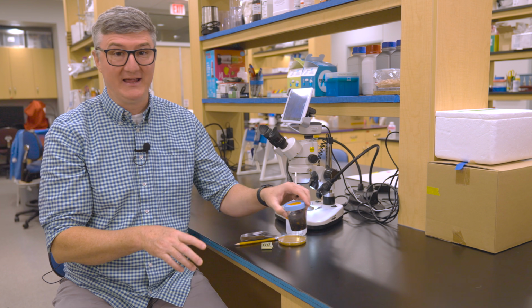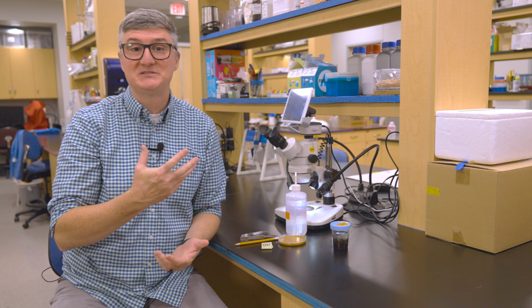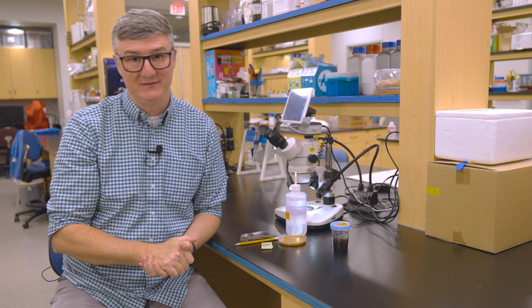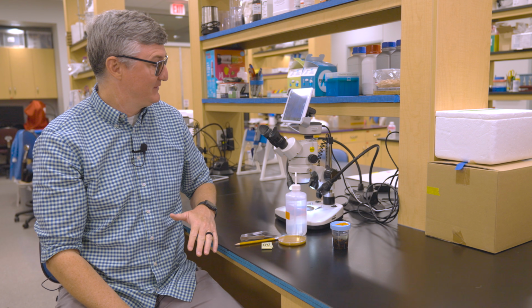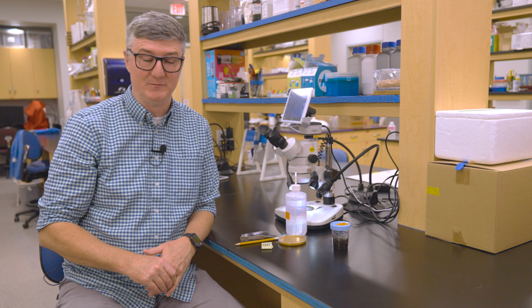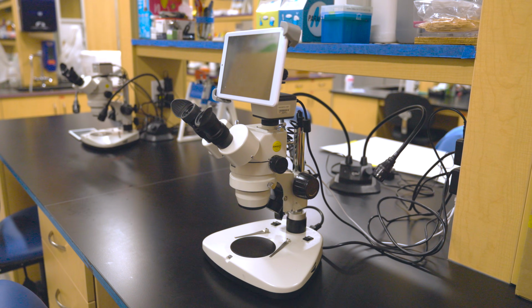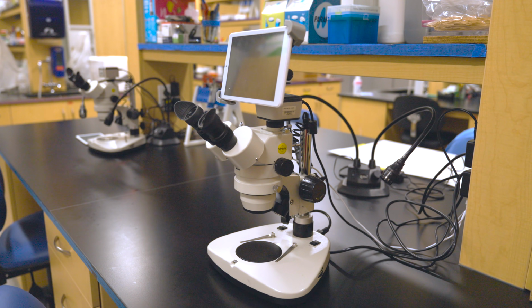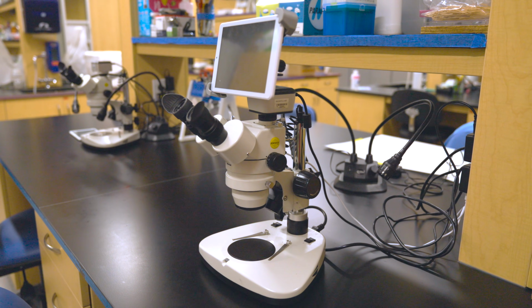With these bees in hand, now you need some basic supplies and at least one piece of equipment. We'll start with the equipment. You need some sort of dissecting microscope. This is not the type of microscope you were likely to have looked at cells in, bacterial cells or other cells in when you were in high school.